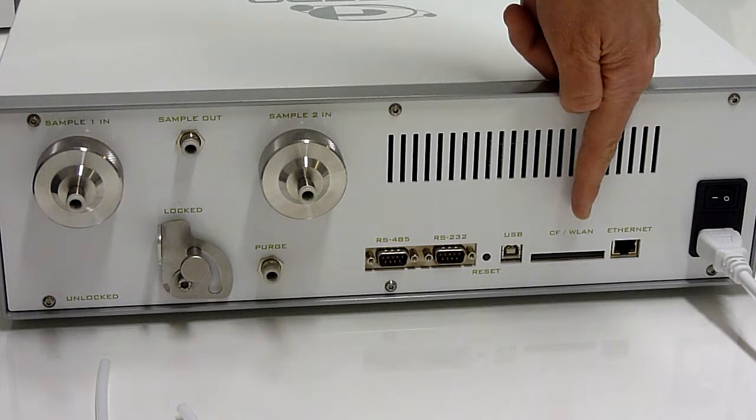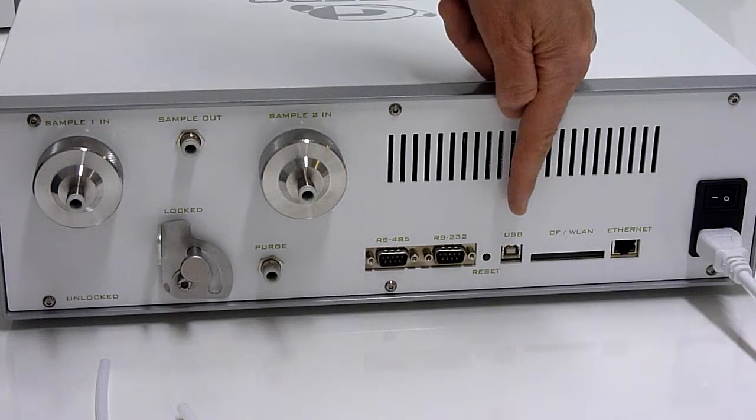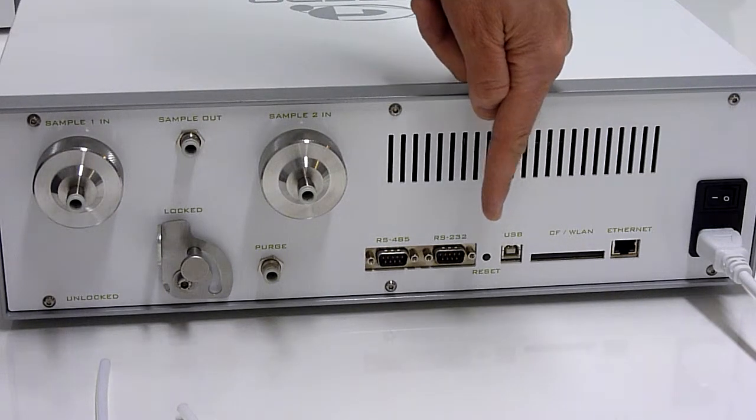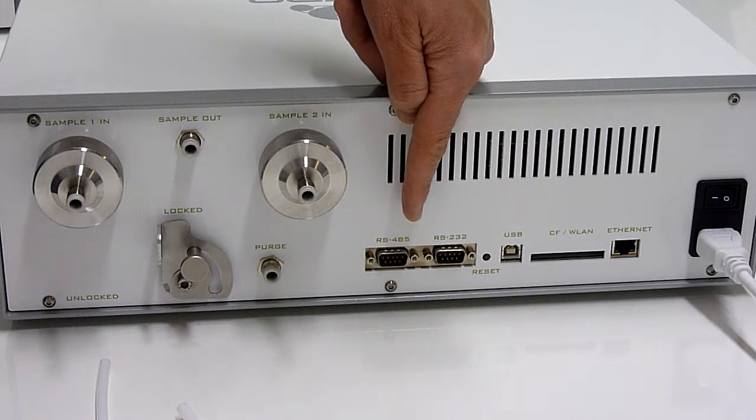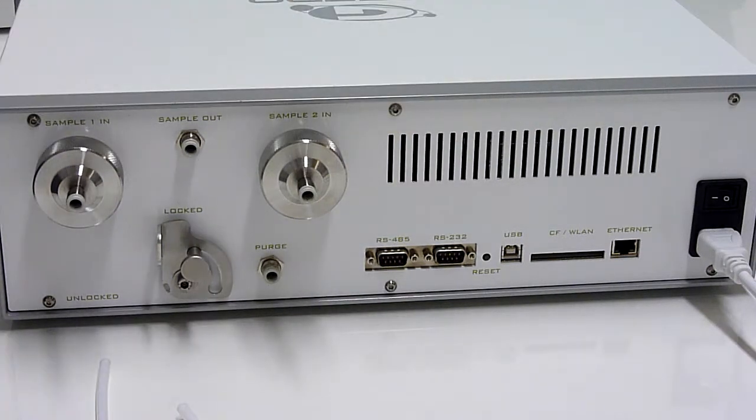In this slot you can place the PCMCIA card, for example for Wi-Fi or other applications. There is also a USB connector and two serial ports for digital data transfer or for an analog output module.